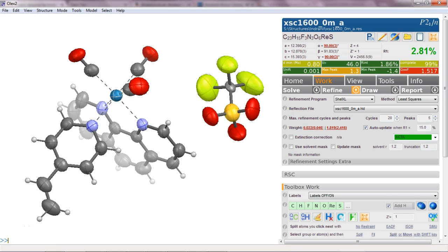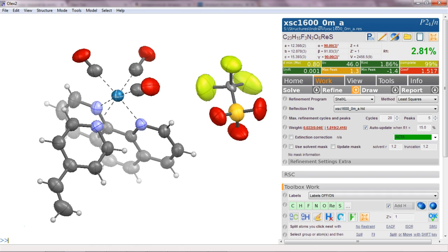Here's a nice example of a triflate disorder and I show you how the current version of Olex 2 could handle this problem. So let's first have a look at what we've got. So this is the structure.